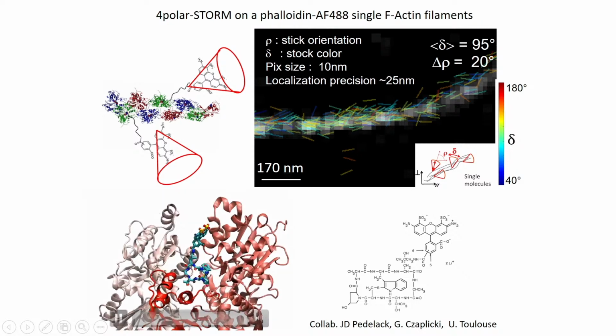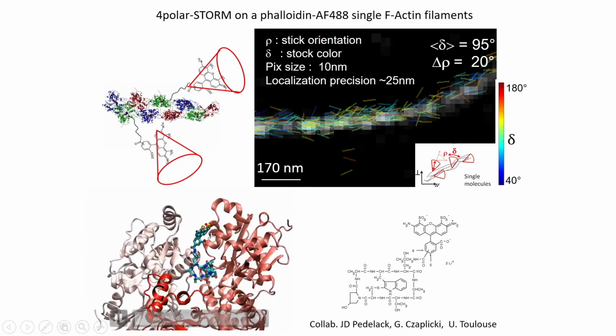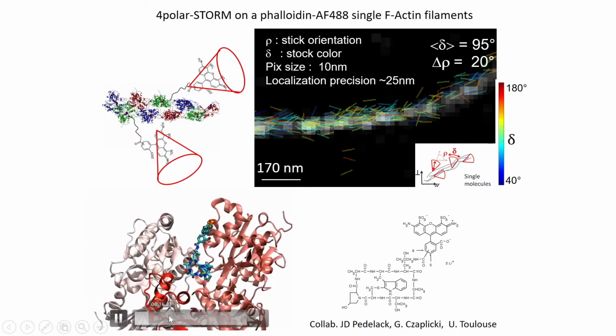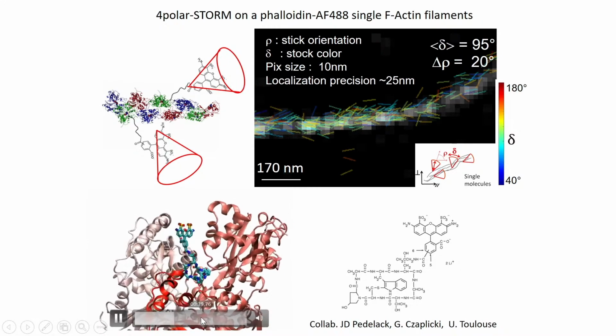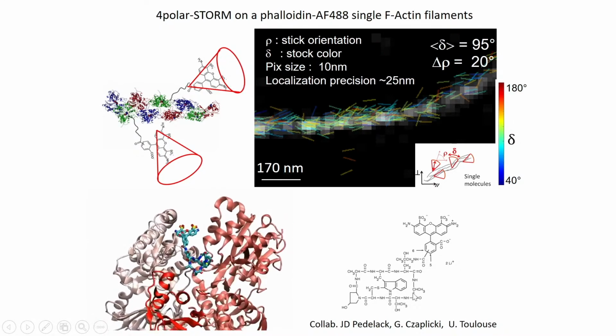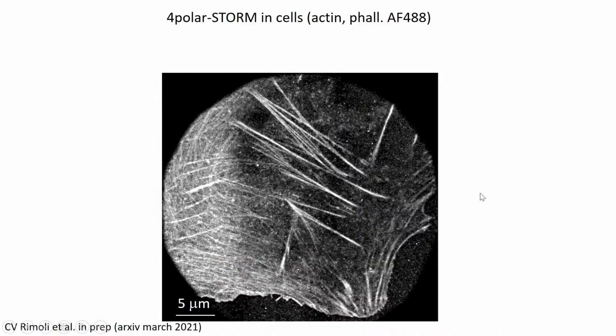So this is actually understood by the fact that this dye is not exploring a single frozen direction. In time, it is able to wobble a bit, to change a bit its directionality by exploring different directions, as was modeled by our collaborators in Toulouse.